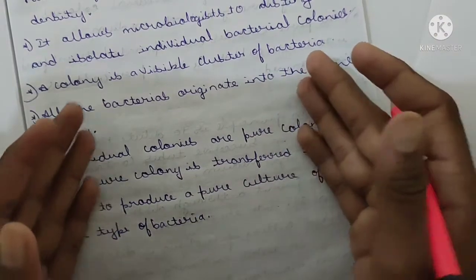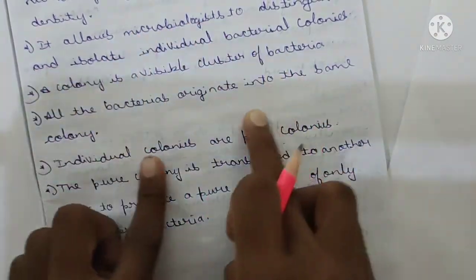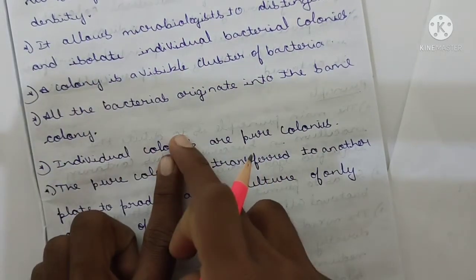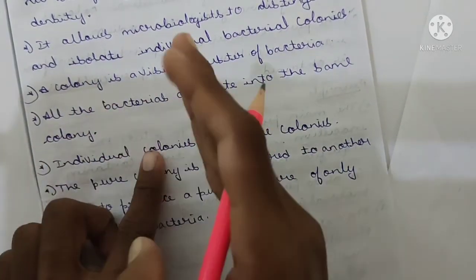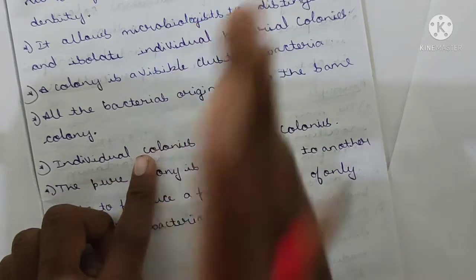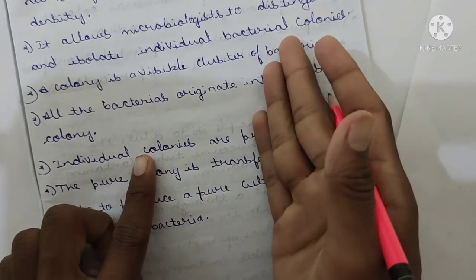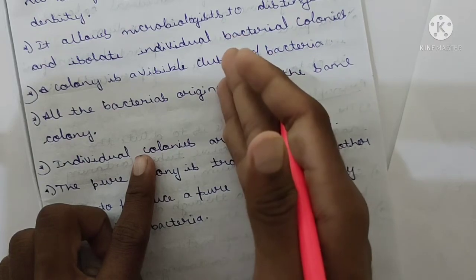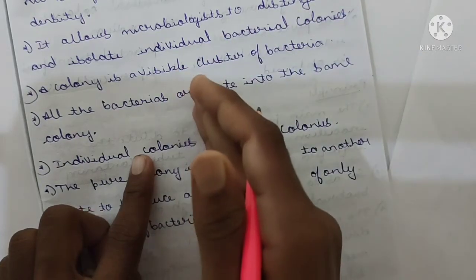Now for an example, just listen. Initially the plate or any tube contains different types of microorganisms. After streaking, we will collect some individual type of microorganism.